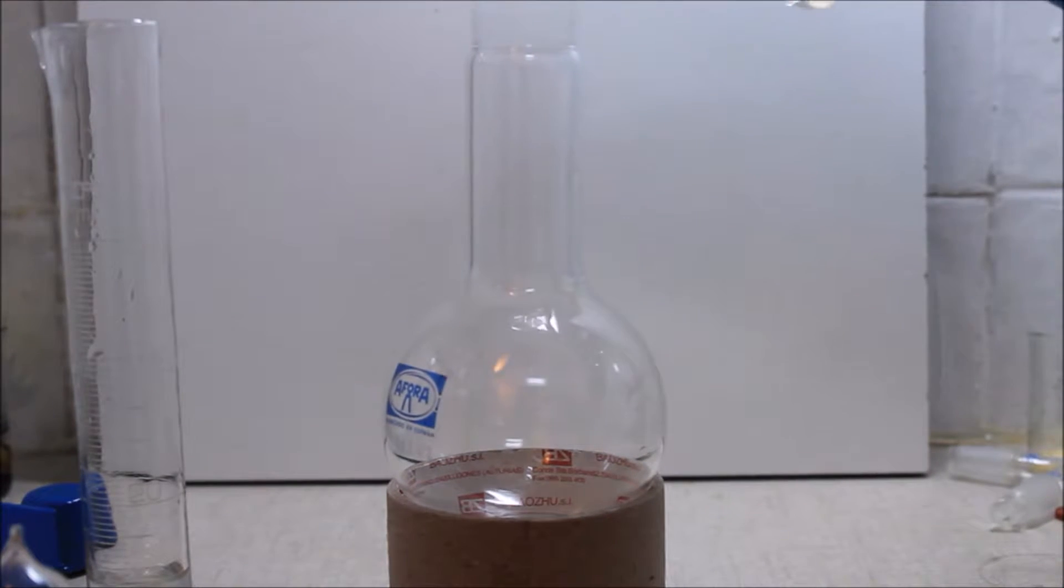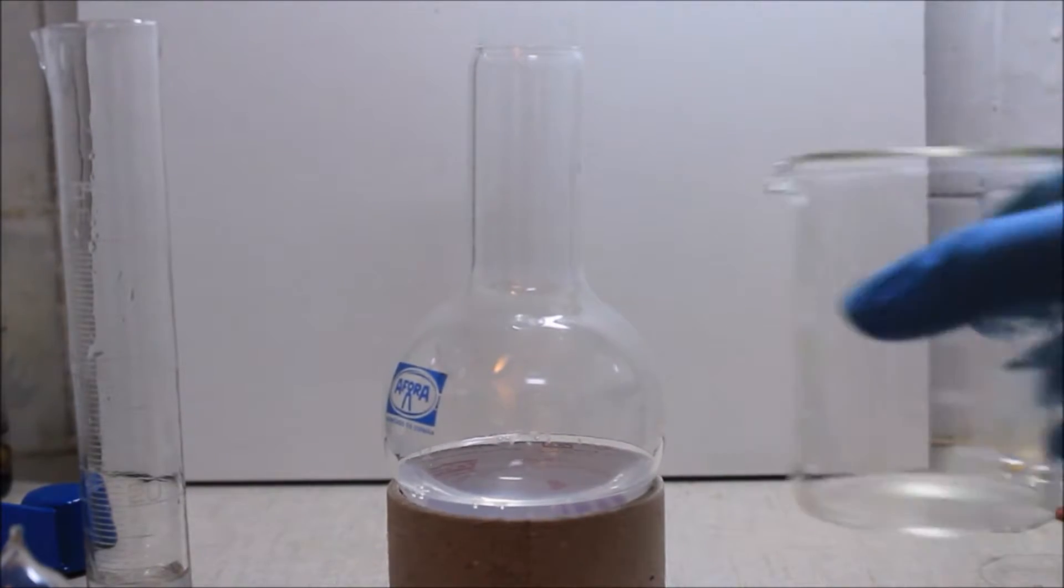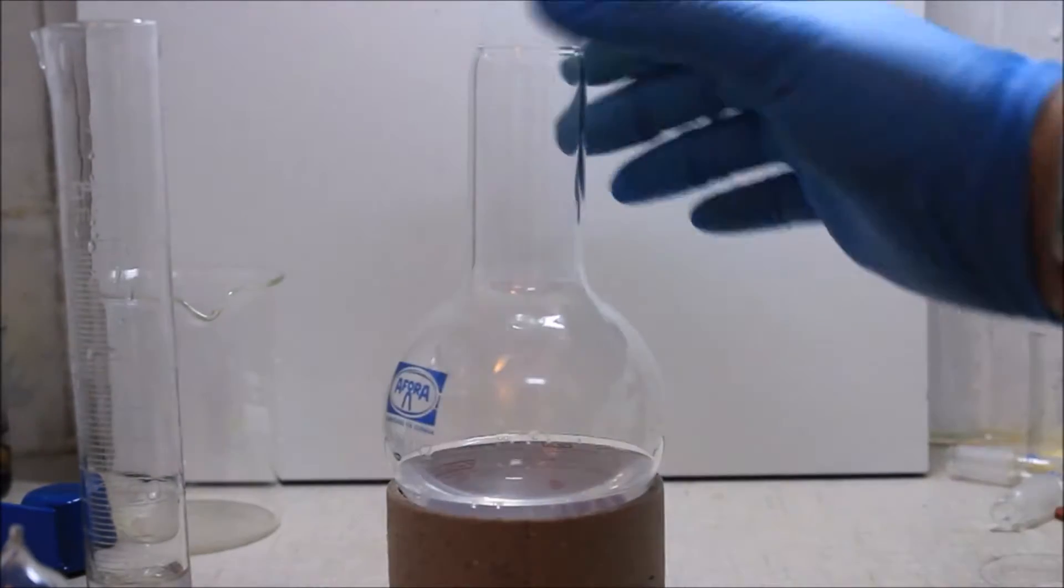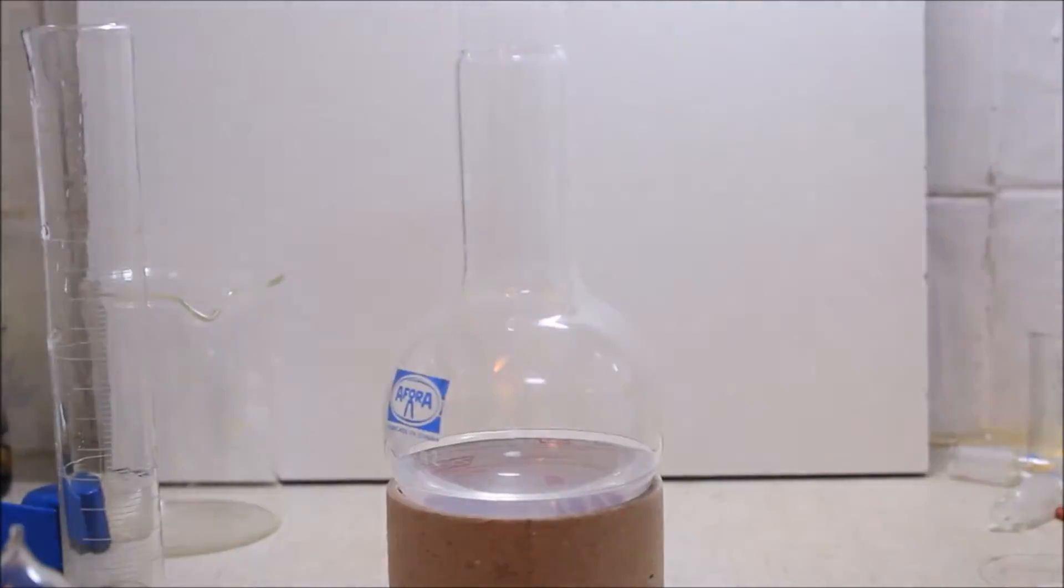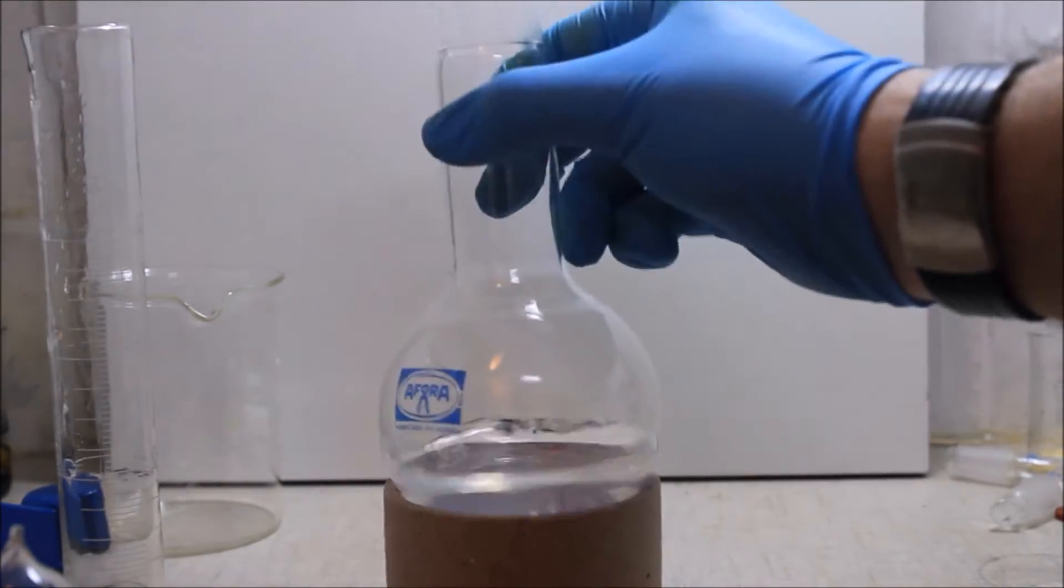Now the silver diamine complex solution is poured into an RB flask or any other container. The flask has been cleaned thoroughly with nitric acid and distilled water. If not, the mirror will not be as shiny as expected. Then 5 milliliters of the glucose solution is poured into the RB flask.